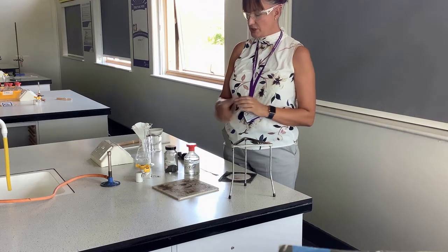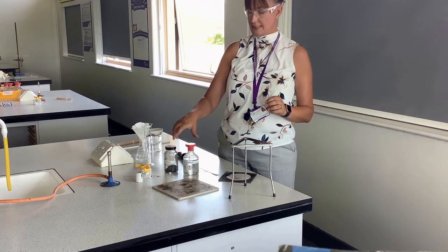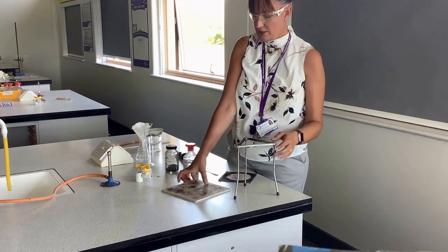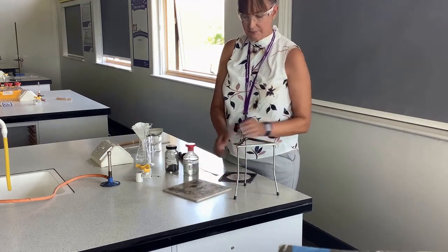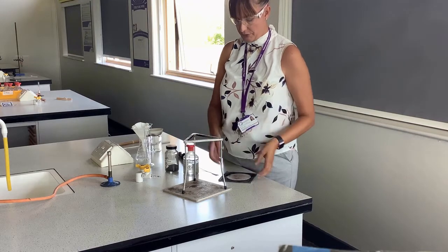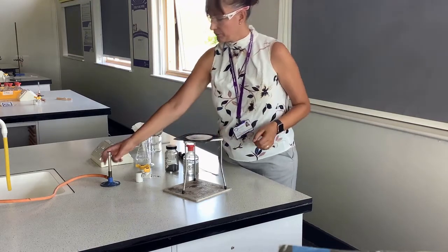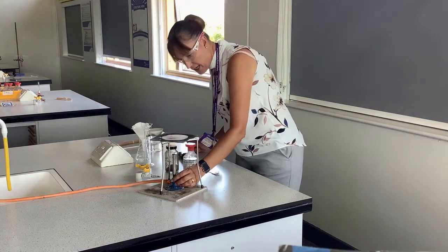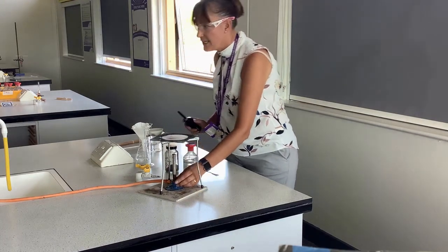First of all then we're going to create our salt, and to do that we are going to need a Bunsen burner. So I have a heat mat, a tripod and a gauze. I have a Bunsen burner, making sure that when I light it, it's on a yellow flame.